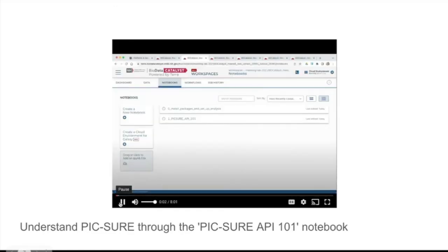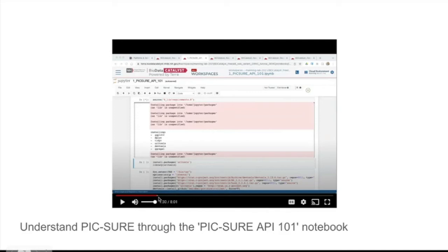probably, you know what, I'm going to not go through this. This is a notebook. I'll just stop at a couple places where all the necessary libraries are installed. This is a notebook that could change over time, so whenever you start a fresh analysis, it's probably a good idea to grab the most recent set of installation steps.